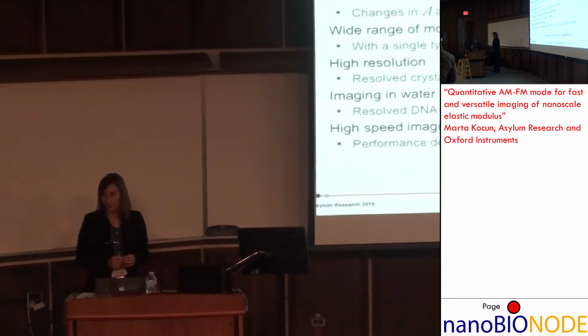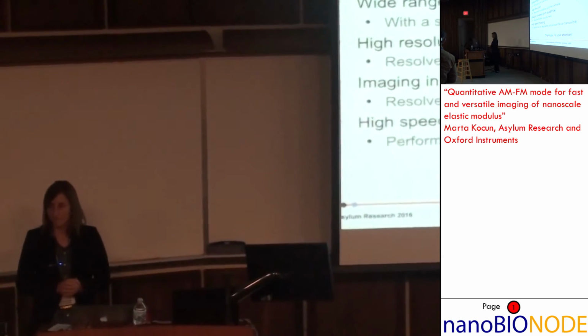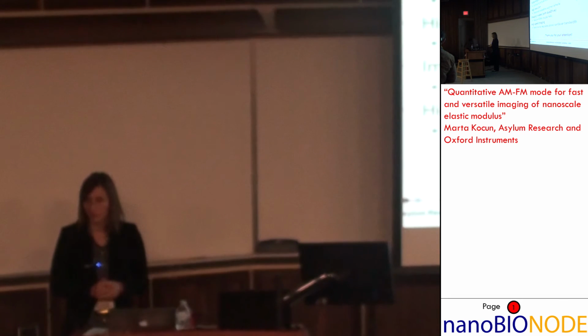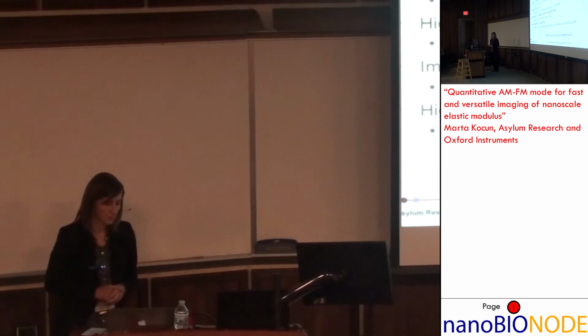Have you looked at samples that have similar Young's modulus, where one is elastic and one is viscoelastic? For example, octene branch polyethylene that would have, say, a 16 or 18 megapascal modulus, and polybutadiene, similar molecular weight, that has an 18 megapascal modulus, but its tan delta is on the order of 0.6, as opposed to the polyethylene tan delta, which is barely 0.1. The question is about elastic versus viscoelastic materials with similar moduli.